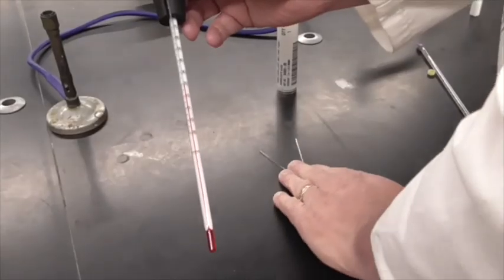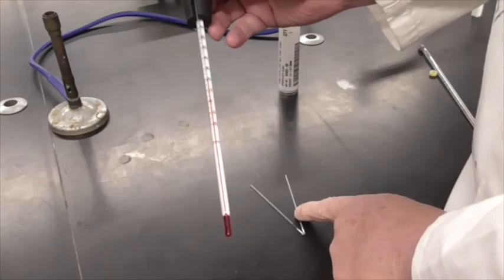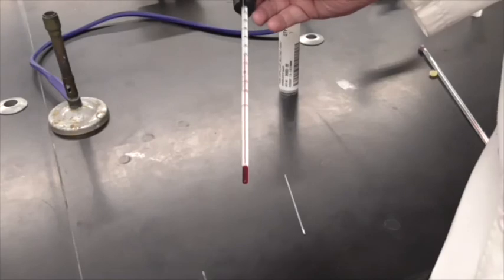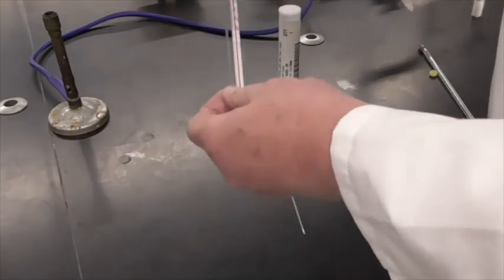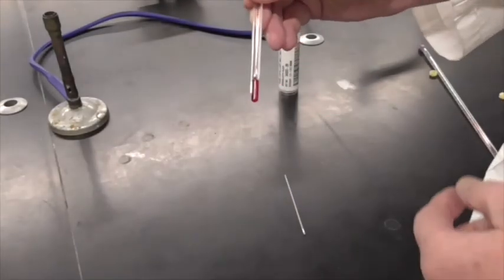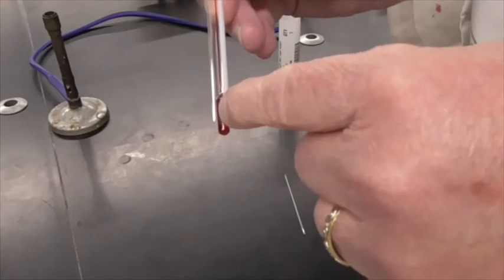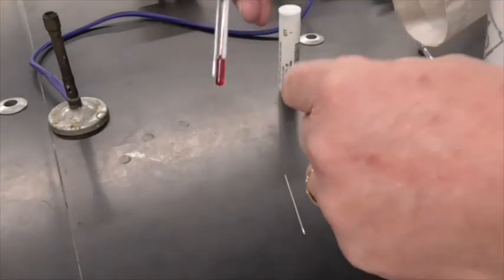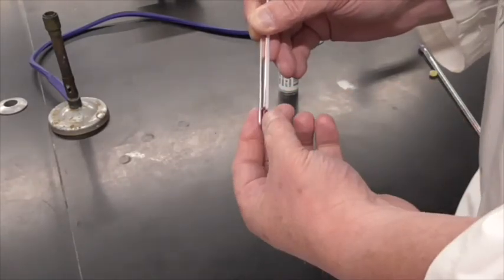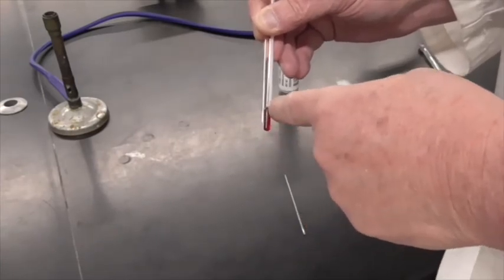Alright, so I have my 2 samples of biphenyl and I have a thermometer. One at a time, I'm going to attach the biphenyl to the thermometer, let me show you, so that the biphenyl is sitting right next to the bulb of the thermometer. The bulb of the thermometer is where the temperature is read. Okay? Whatever is going on in that area of the thermometer is where the thermometer is reading the temperature.